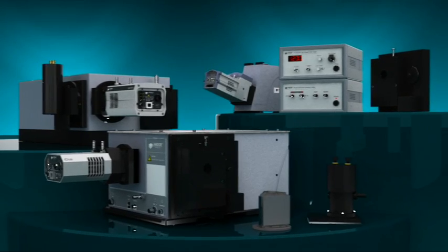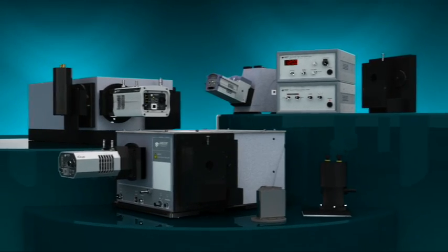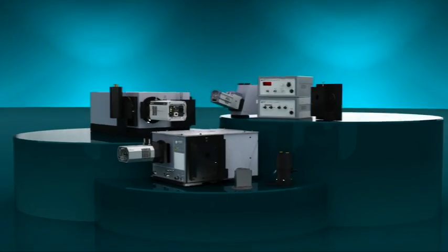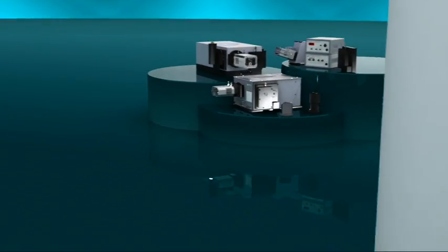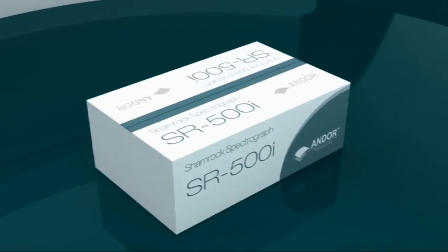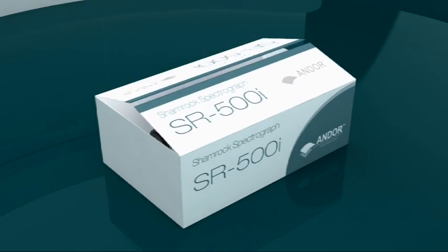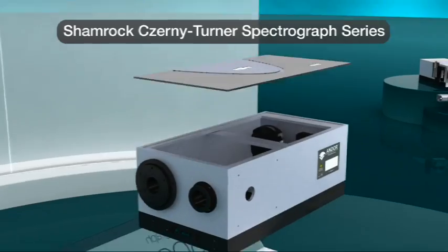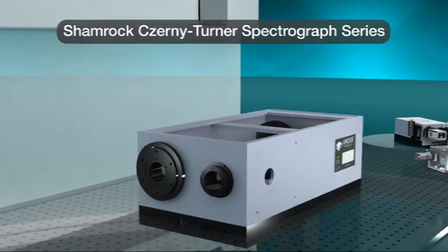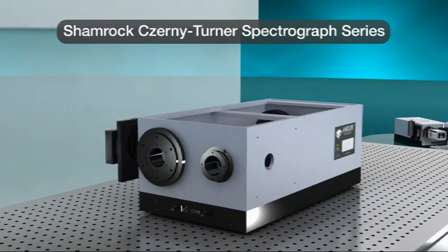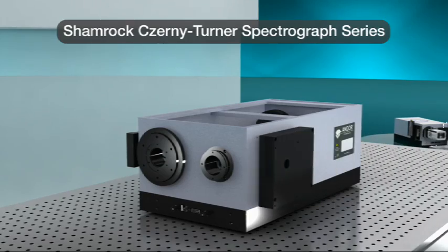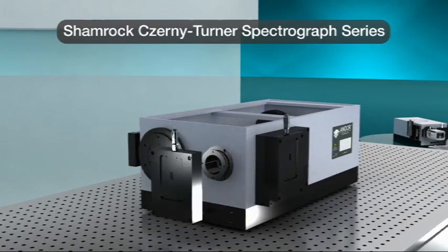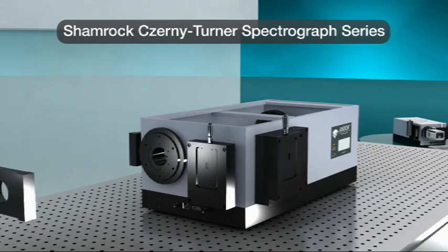At the core of any Andor spectroscopy system is a high-performance, pre-aligned, pre-calibrated spectrograph ready for operation out of the box. The Shamrock Spectrograph series is Andor's highly configurable spectroscopy platform, boasting seamlessly field-upgradable interfaces and accessories.